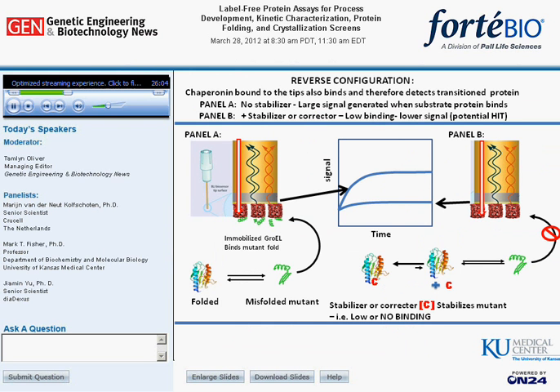In the second setup, we can attach the purified chaperone onto the tips and observe if the target protein binds to the chaperone or is stabilized by potential lead compounds. In both instances, we can generate an easily observable yes-no output signal that allows us to identify if a lead compound is a potential ligand or stabilizer.